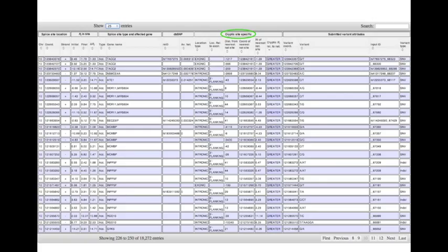Cryptic site specific columns appear only when viewing the table within the cryptic site tab. These fields are not applicable to natural sites. Finally, columns in the submitted variant attributes heading describe the attributes of the variant in the VCF file we uploaded. The first 3 columns, labeled chromosome, coordinate, and strand, describe the genomic location of the splice site.